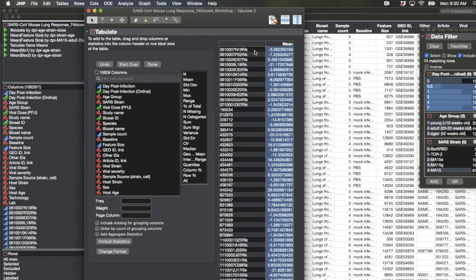If you're going to rate these genes, this is the one number I want to give to say, this is what this gene does over this time point. What I'm trying to do is find the things that are the highest and the lowest.